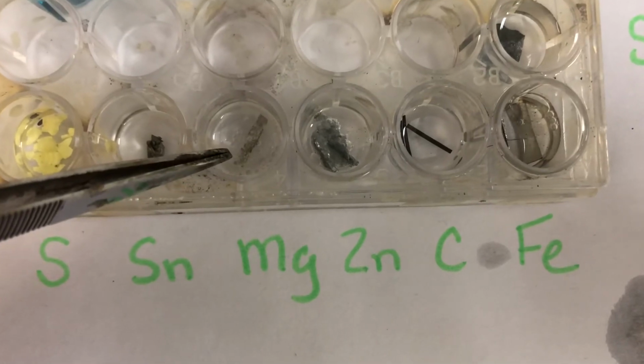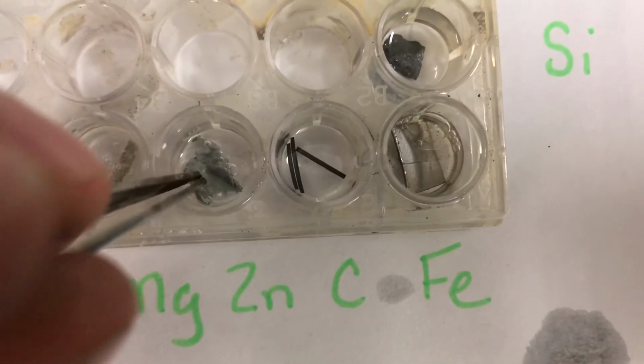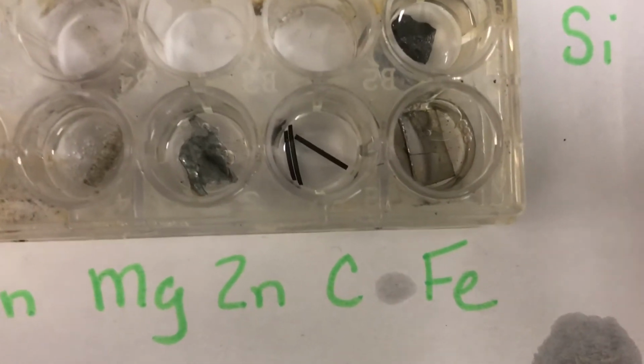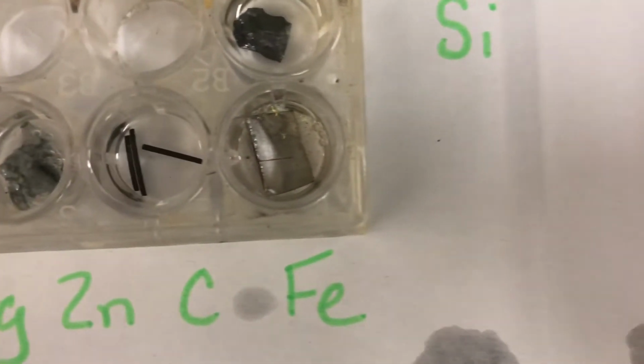Magnesium, I don't know if you can see that, but it's bubbling and fizzing still. There's definitely a reaction. Zinc, we're getting some bubbling and fizzing in there as well. So little bubbles forming. So that is definitely a reaction. For carbon, no reaction looks like it's taken place.